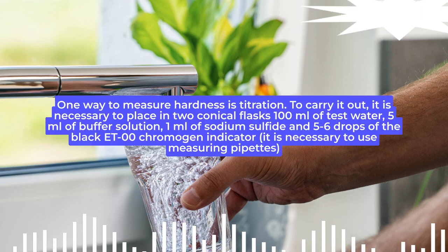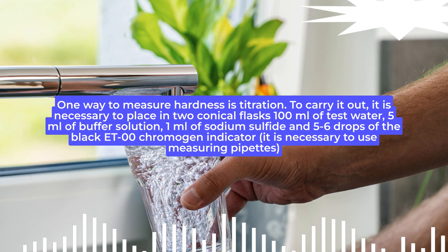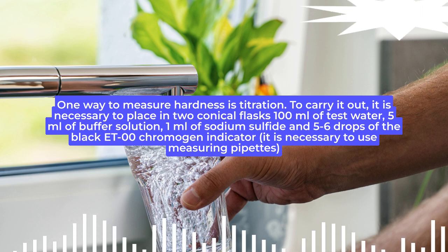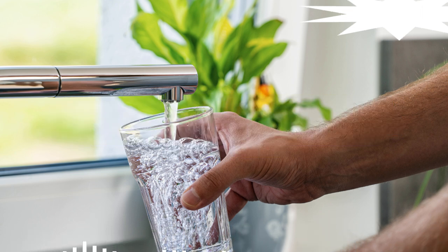Step 2. One way to measure hardness is titration. To carry it out, it is necessary to place in 2 conical flasks 100 milliliters of test water, 5 milliliters of buffer solution, 1 milliliter of sodium sulfide and 5 to 6 drops of the black ET00 chromogen indicator. It is necessary to use measuring pipettes. After mixing, the solutions are pink.